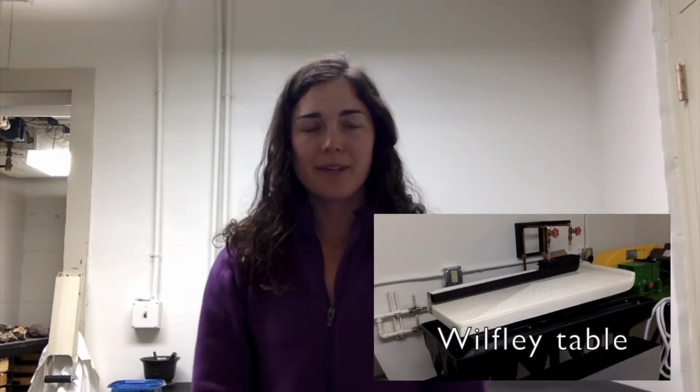In this step of the mineral separation process, I'm going to demonstrate how to hand wash samples. This is an alternative to using a Wilfley table, which I'm not using in this case because my sample is small and I don't want to lose any material. The goal with hand washing is to separate and remove any really tiny particles such as dust, so that when we move on to the hand magnet and Frantz, we don't have dust flying around.